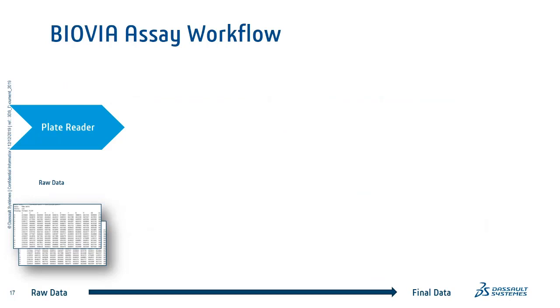It all starts with being able to read and understand the raw data, which typically are files produced by instruments in many various formats. So you need to be able here to accommodate all those different formats. And so there is a need here for some flexibility for advanced users to define the readers that will be able to understand a specific type of data, and for the end users to pick that reader.